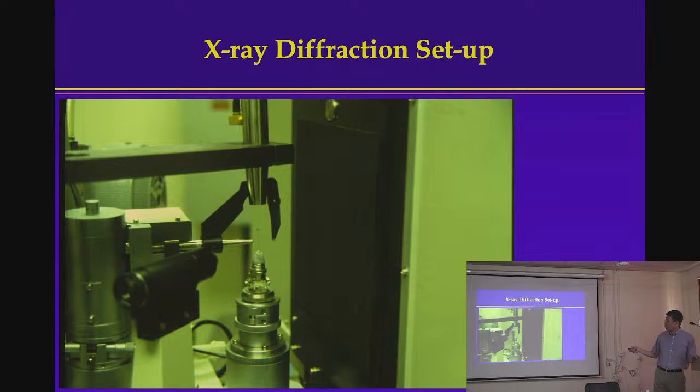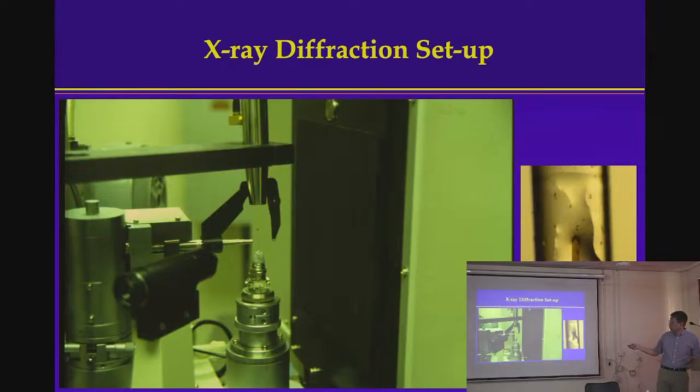So you have X-ray coming out of this metal tube. I'm not showing the back, you can see that. There's a capillary right here, and then this is the piece of wax right here. And then this is the so-called goniostat that rotates the crystal around in your experiment. So as the beam comes out, it hits the crystal, which you saw right here, in this capillary.